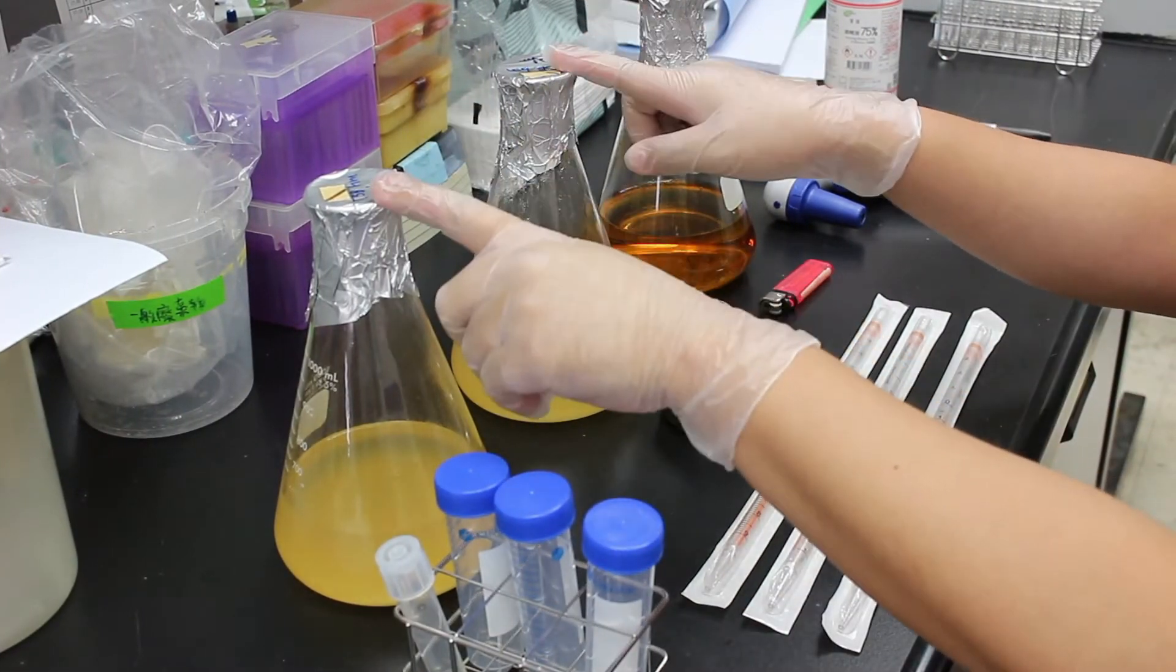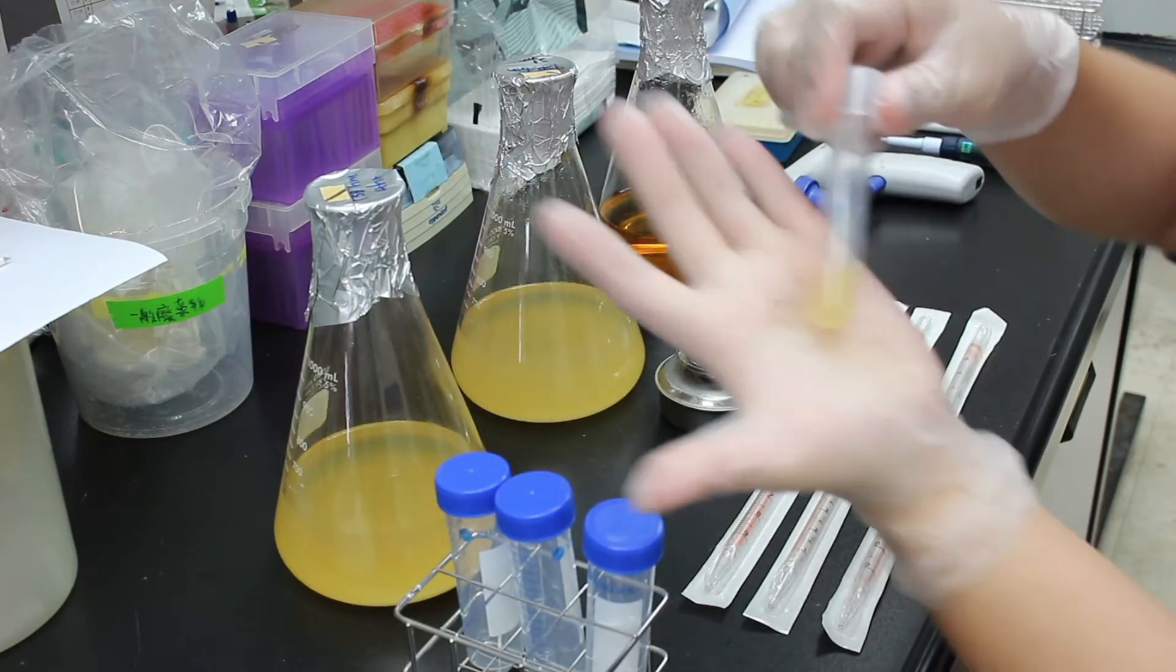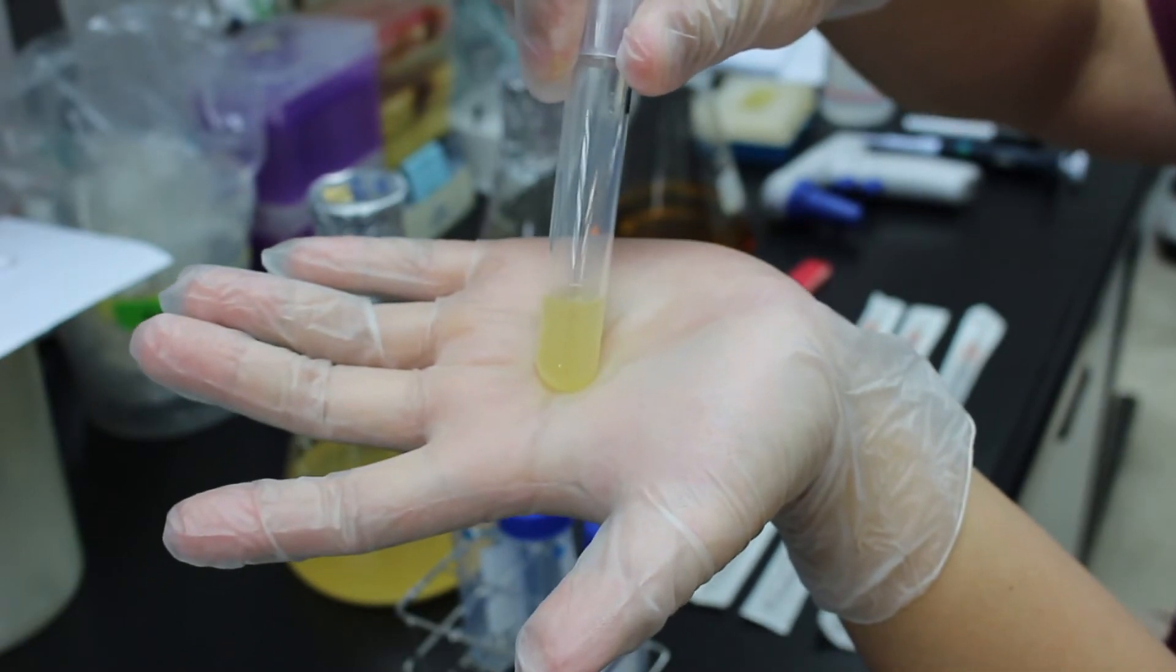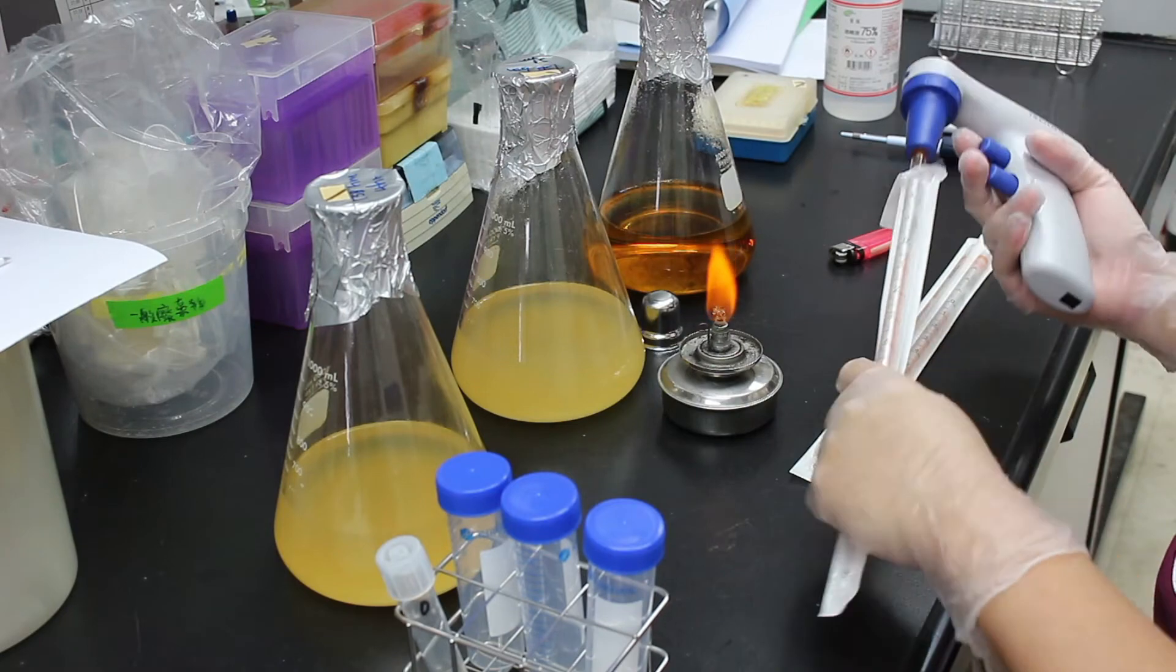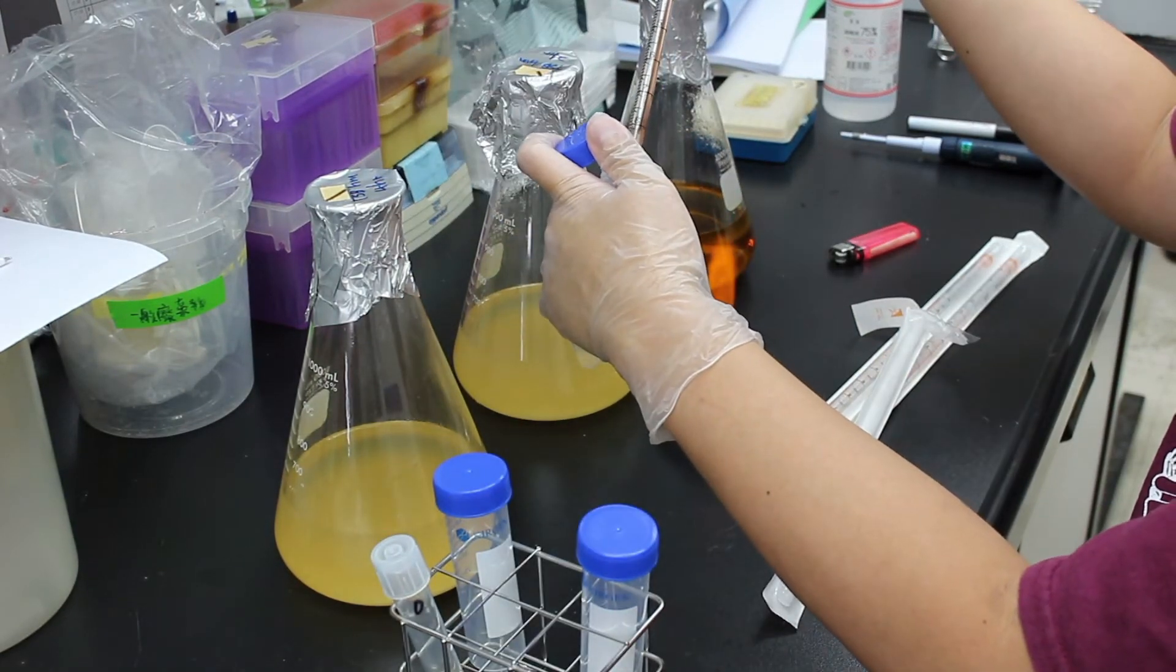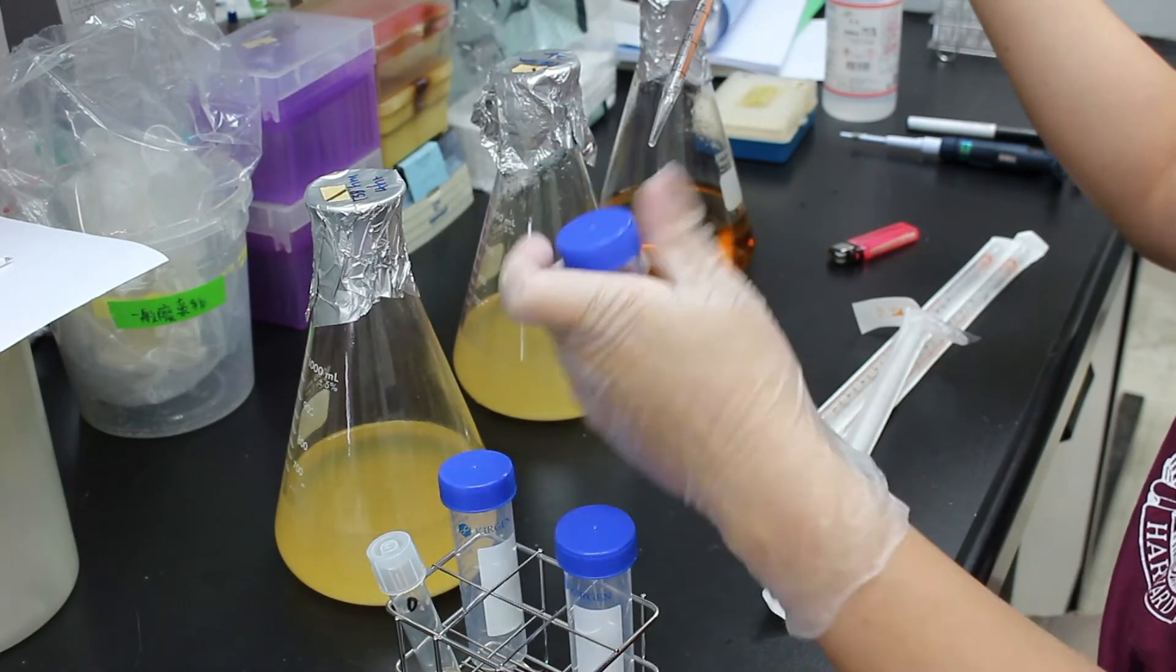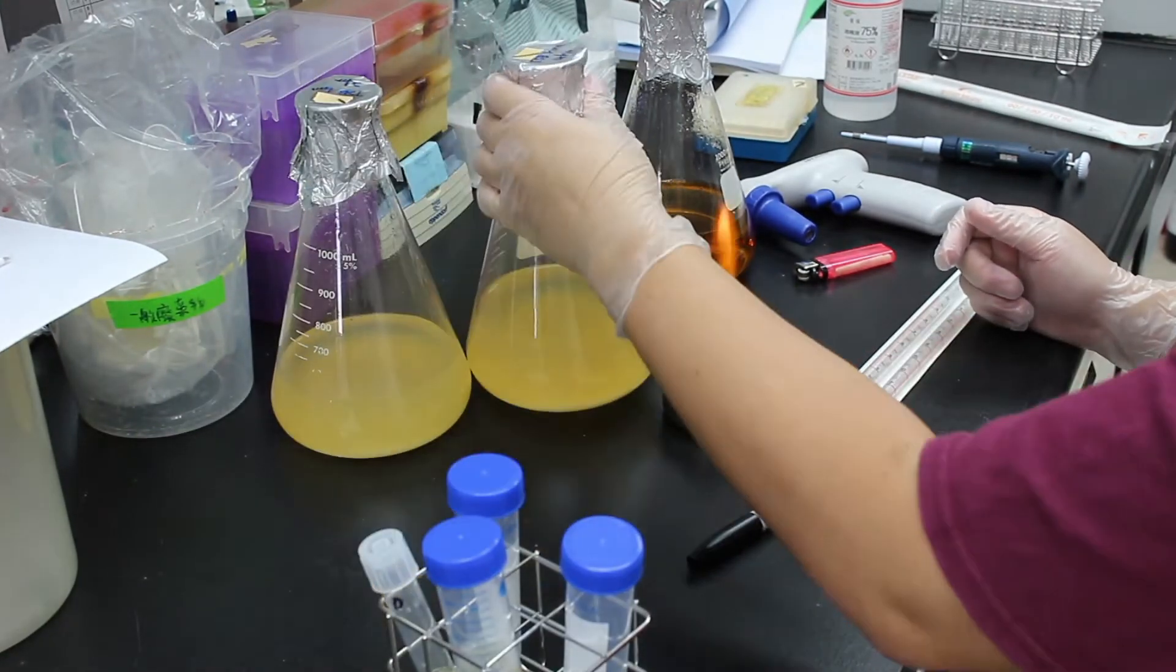Here are my homemade media. Now I want to test how good they are. I have prepared some overnight culture of mixed bacteria and will put them into my homemade medium as well as this commercial TSB. Then I will measure the absorption rate at 600 nm every hour. This will let me know how many bacteria are inside the medium.